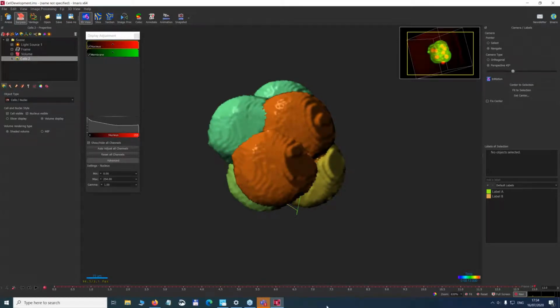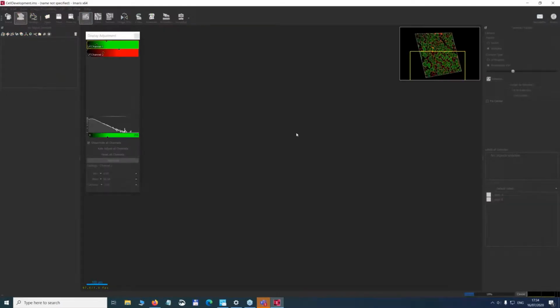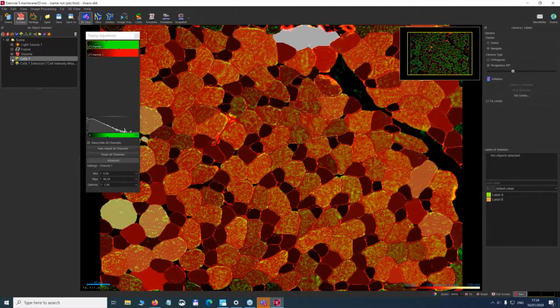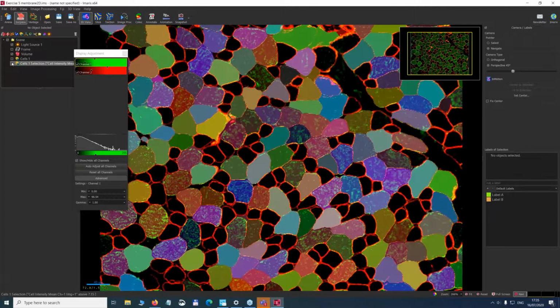So Anne-Marie is asking, how well does it segment cells of different types or maybe different shapes? And would you need to do 2 different rounds of the segmentation? There can certainly be cases where, especially if you're working on a whole organism or something like that, you have vastly different cell sizes. In this example right here, there are some big differences. Thanks for doing the show and tell on the other end. And you'll have to see, depending on your exact situation, how different those cell shapes really are.